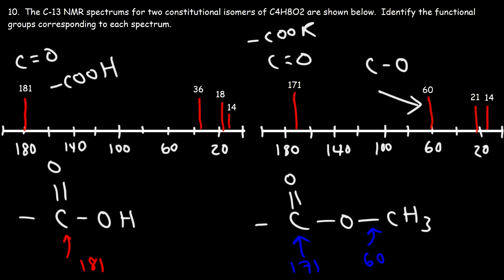And so this is one way in which you can distinguish a carboxylic acid from an ester. An ester will have the signal at 170 and the CO signal between 50 and 100, whereas the carboxylic acid, it's not going to have the CO signal between 50 and 100.